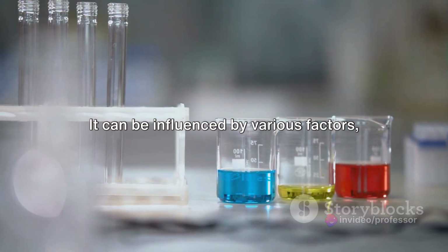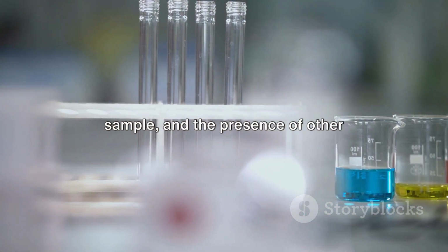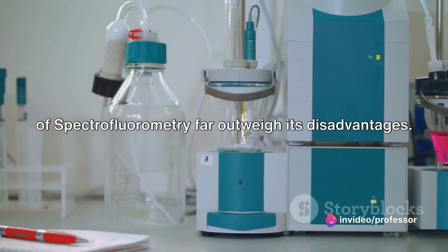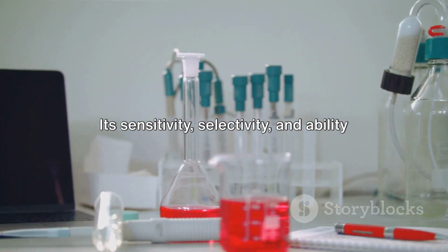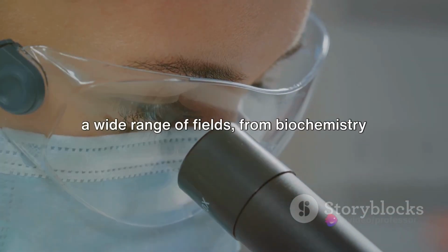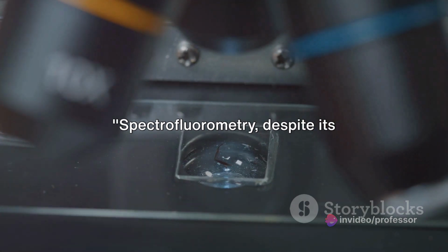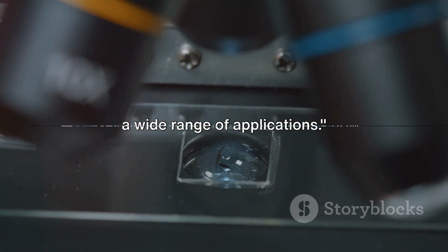However, as with any technique, spectrofluorometry has its limitations. It can be influenced by various factors, such as the pH and temperature of the sample, and the presence of other substances that may interfere with the fluorescence. Despite these challenges, the advantages of spectrofluorometry far outweigh its disadvantages. Its sensitivity, selectivity, and ability to analyze multiple components simultaneously make it a powerful tool in a wide range of fields, from biochemistry and medicine to environmental science and materials research. Spectrofluorometry, despite its limitations, is a powerful technique with a wide range of applications.